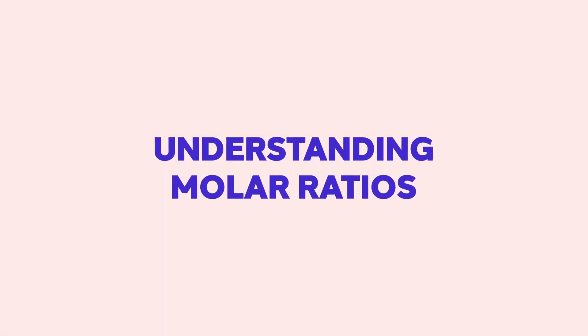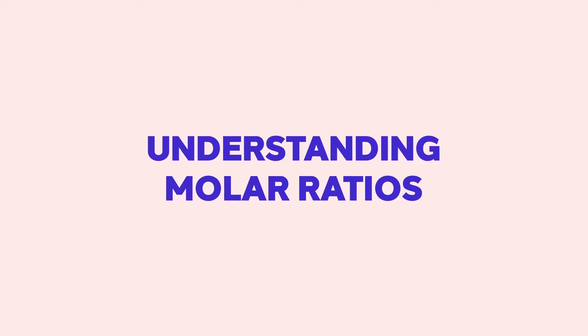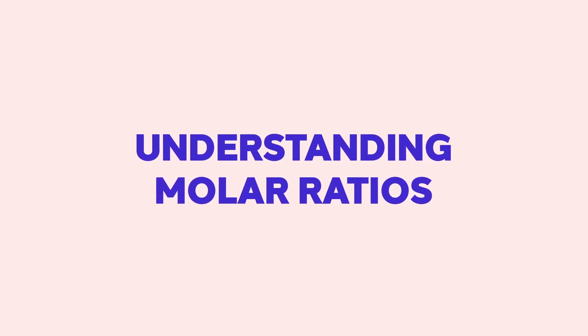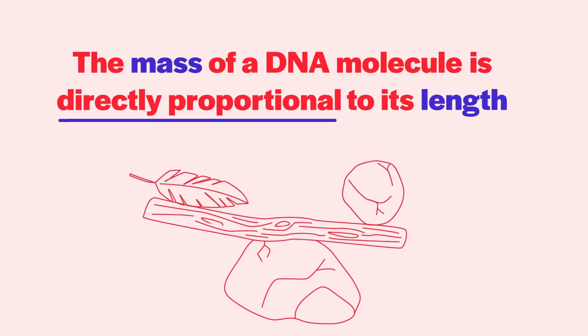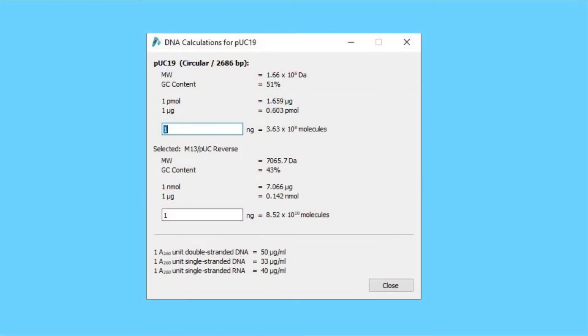Tip five: understanding molar ratios and when they matter. For many protocols, you need to be aware of the molar ratios that you are combining, and many protocols will indicate what molar ratio you are striving for. You cannot simply mix 100 nanograms of fragment A with 100 nanograms of fragment B and expect to be in range for the reaction to work — not if fragment A is 10 kilobases long and fragment B is only 250 base pairs long. The rule of thumb is that the mass of a DNA molecule is directly proportional to its length. SnapGene includes a DNA calculations tool to help you access many of the relevant physical properties and calculations about any particular DNA fragment.